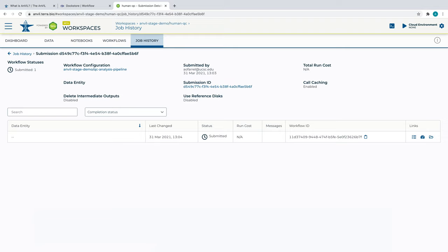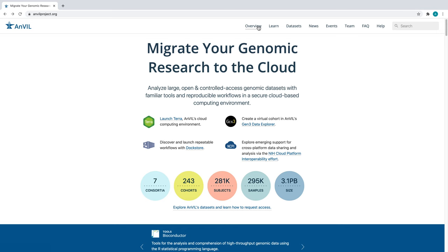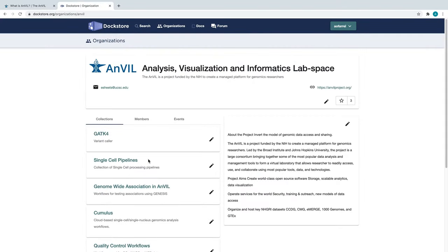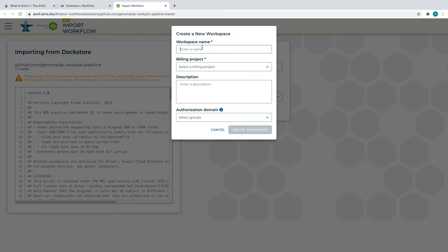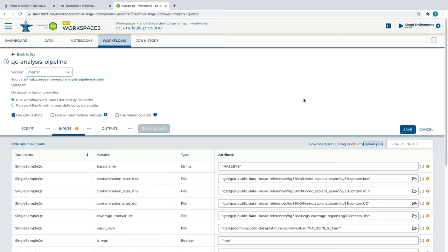Let's recap our process. Starting from the Anvil homepage, we found the Anvil organization page on DocStore, selected a workflow from that organization, imported it into Terra, and ran the workflow using inputs specified in a test JSON file.